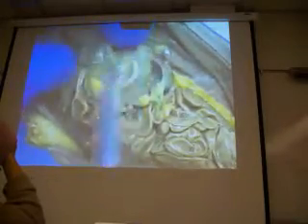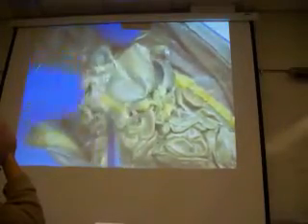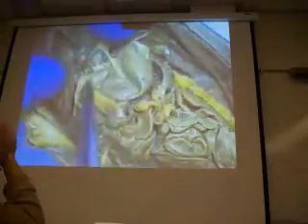Right. On the rat, there is no gallbladder. Right. So we've got the stomach kind of coming around. The first curve is the duodenum. So here's the duodenum. Going right here in my finger. So here's the end of the stomach. Here's the duodenum. And as I move this stuff up and out, see this brown substance right here?